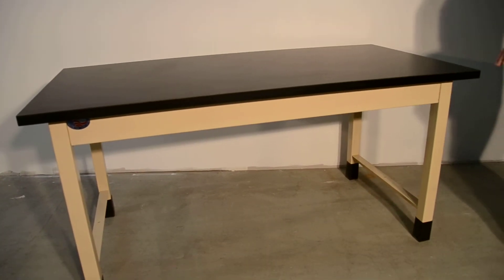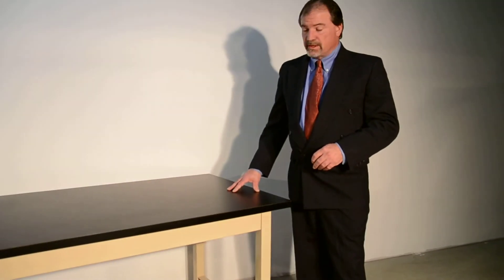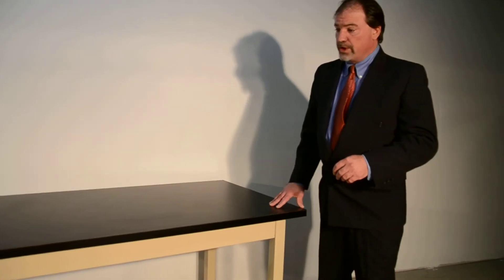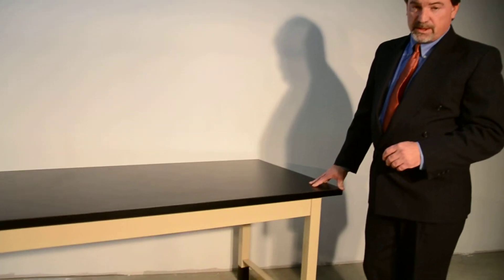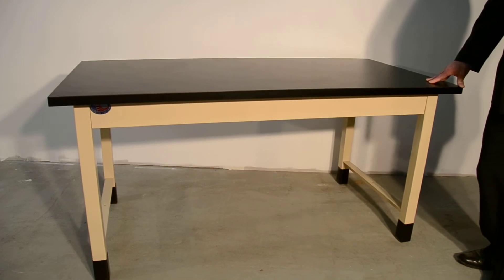We offer this workstation with three different work surface types: ChemGuard chemical-resistant laminate, which we're showing here—it's an 1/8-inch thick chemical-resistant laminate, and we do have specifications on our website for that. We also have a 304 2D stainless steel finish and epoxy resin work surfaces as well.